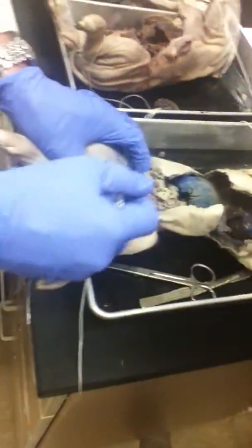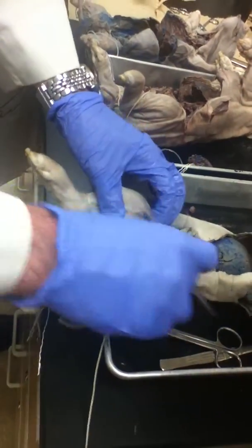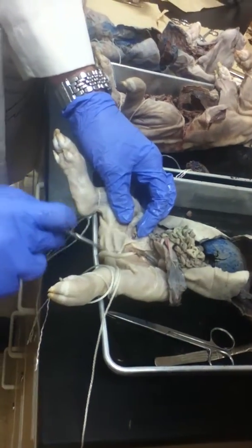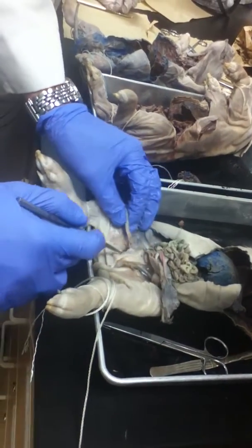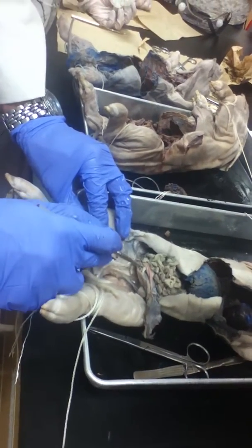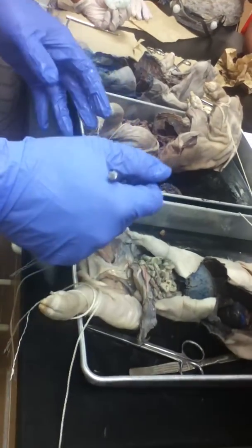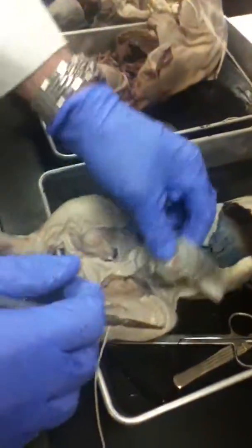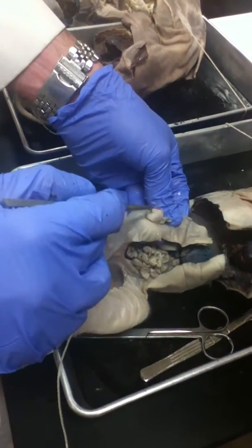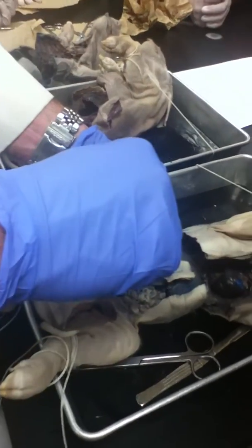This here, that's the penis. The scrotum is the sac that holds the testes. This is a testis that connects to the vas deferens, which, if you follow this up through, connects to the penis, so that you could send sperm into the penis so you can fertilize a female. We already went through all of that stuff. What about the adrenal gland? The urethra is the opening. Urethra leads to the urogenital opening.